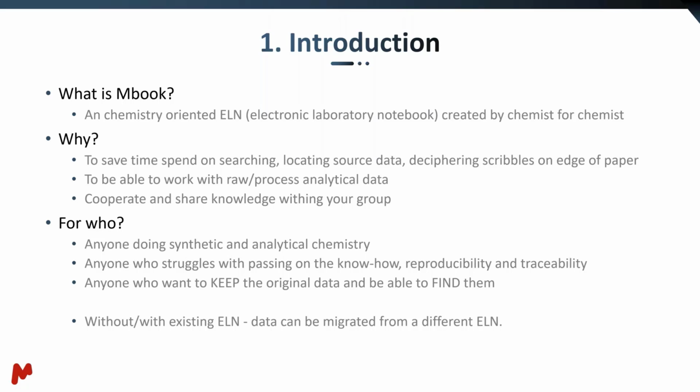And this is the way how you can share the knowledge within your group. So for whom is the Mbook? For anyone, basically anyone who does synthetic chemistry and analytical chemistry. Also for anyone who struggles with passing on the know-how, so let's say an academic laboratory, when the postdoc leaves and takes the know-how with himself because no one can reproduce the work or cannot find the correct records. So that's one target audience.